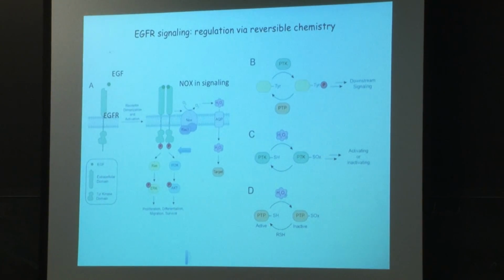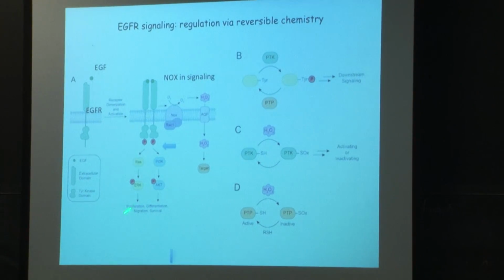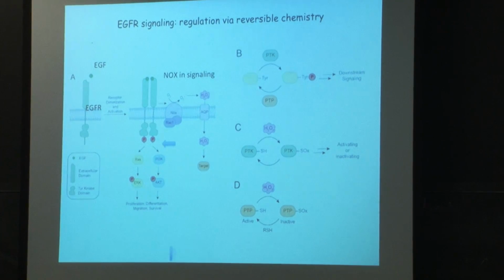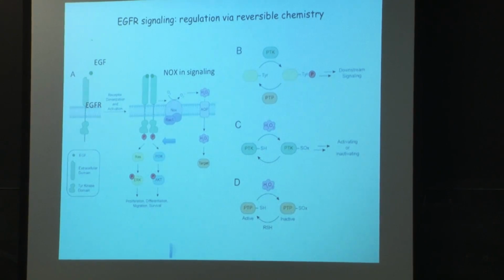Anybody remember that? Were you confused by that? It was in figure 1, if I remember correctly. It was a phosphorylation of these different things. So they looked at phosphorylation. And how can you do that? You can have an antibody to, yeah, by some kind of Western.